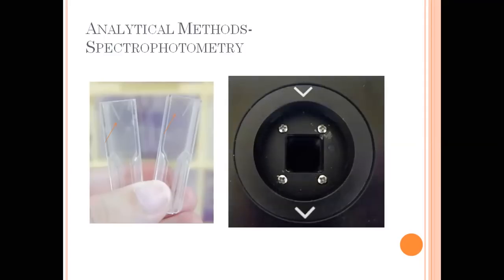Okay, and this is the actual photo of the cuvette port, or the so-called temperature controlled cuvette holder, that has also arrows present on that. So those arrows present on that indicate the light path of the spectro. So pag ganyan, yung tama ng light, that's why it's very important. Ma'am, para saan po yung arrow na present sa cuvette?